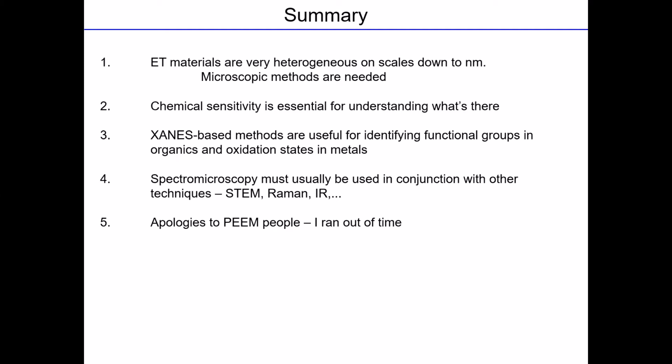However, tychography will definitely be upgraded because as of now it can be brightness limited, and so you'll be able to do things a lot faster. You'll be able to do tomography and so forth, and so you'll be getting torrents of data.